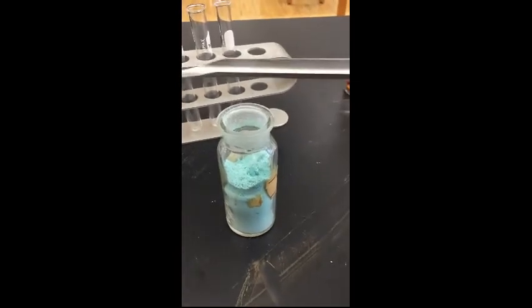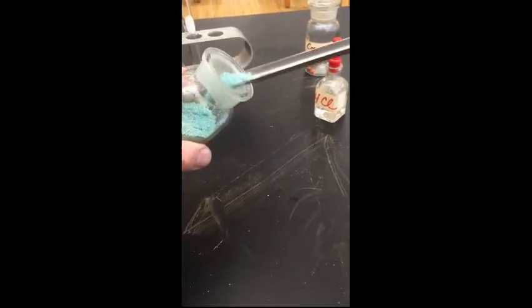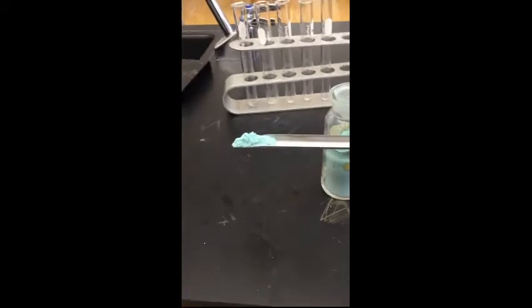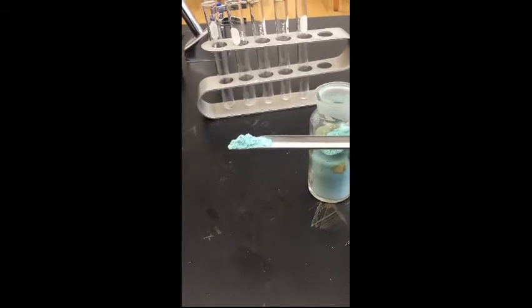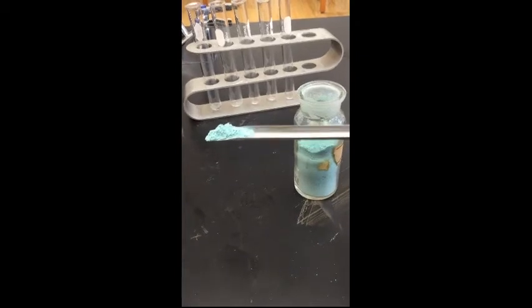This is called a regular spatula, not a micro spatula. So I'm going to take probably a quarter of this or less. Okay, you can note what it looks like. It's got an aquamarine look to it, color, and it's powdery.